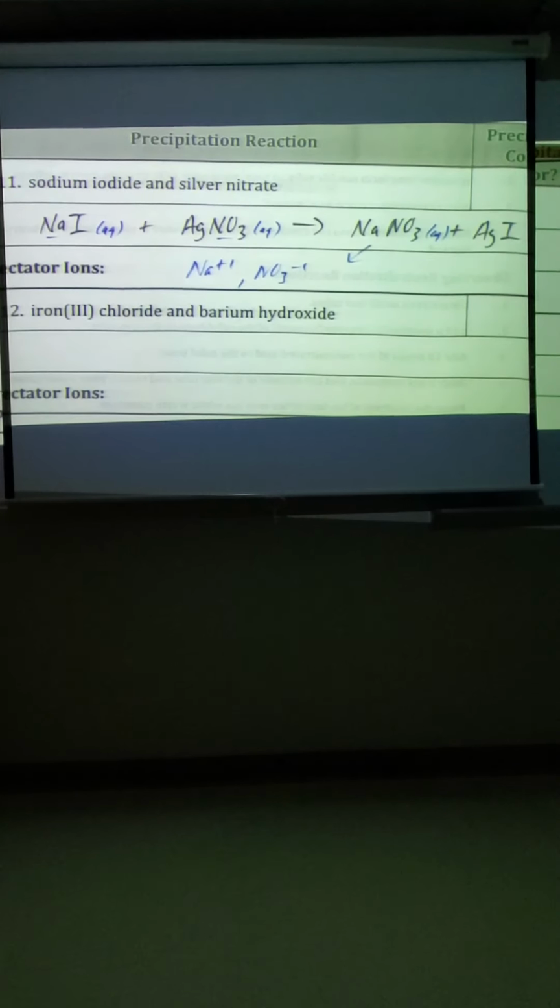All right, here we are with our first one. We have some lead nitrate and potassium chromate. So if you look at our bottles, we have them starting with silver nitrate, A in the alphabet, all the way across, aluminum sulfate, barium chloride, barium nitrate, barium hydroxide, cobalt chloride, copper sulfate, iron chloride, potassium bromide, potassium chromate, potassium dichromate, potassium iodide, sodium chloride, sodium iodide, NaOH, which is sodium hydroxide, sodium sulfate, ammonium chloride, nickel chloride, and then finally lead nitrate with the letter P.